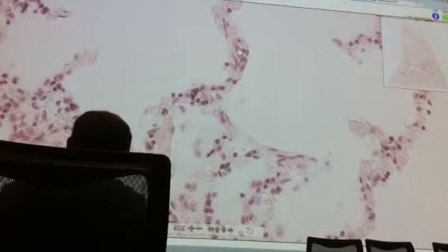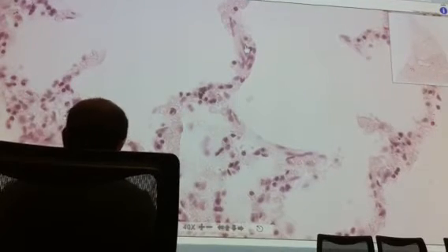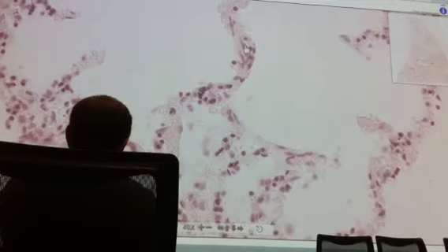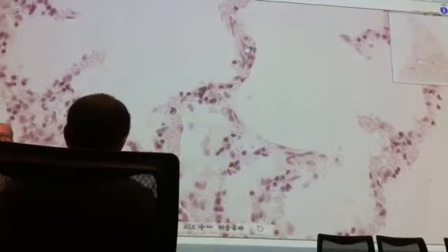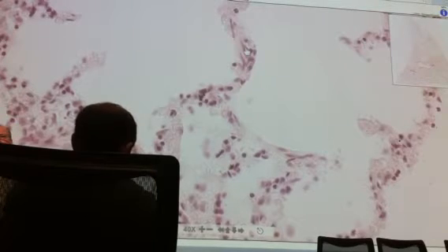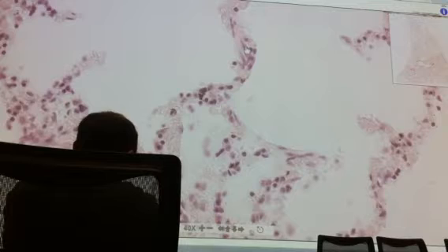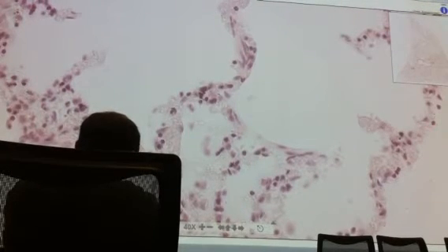And that's all you have to do now. Understand, theoretically, depending on how you section it, some of those that appear to be in the wall could actually be on the surface, facing you. So it may not be exact, but it's good enough for what we need right now. Okay, so just go by where they are, and don't worry about the subtlety.